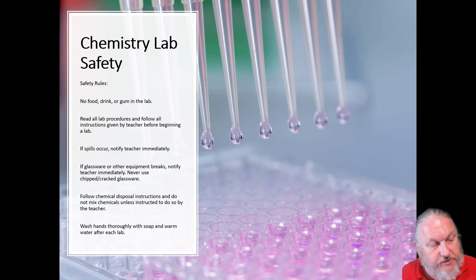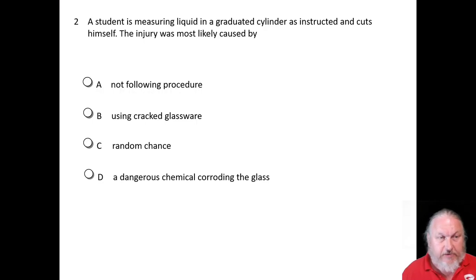Let's do a check for understanding. A student is measuring liquid in a graduated cylinder as instructed and cuts themselves. The injury is most likely caused by what: not following procedure, using cracked glassware, random chance, or a dangerous chemical corroding the glass? Let's pause. Of course the answer to that is B, using cracked glassware.